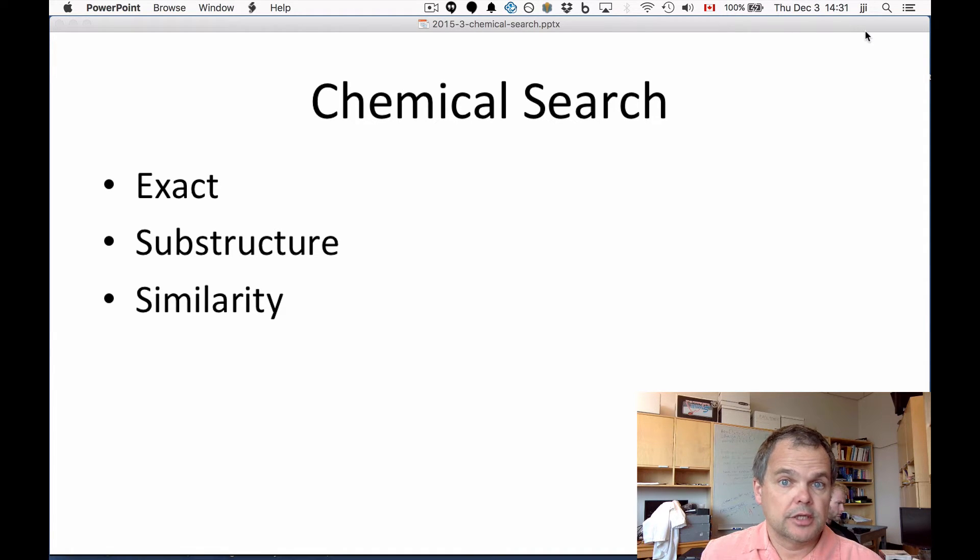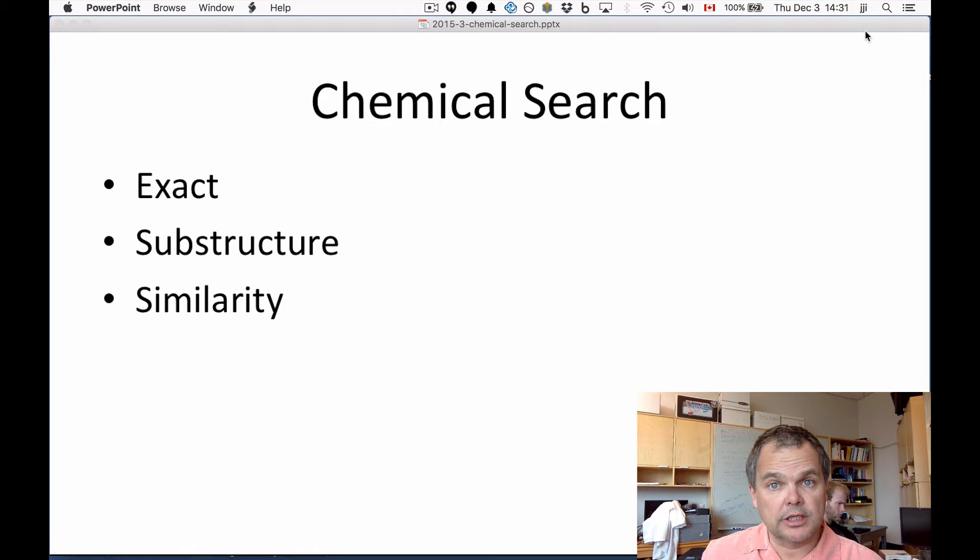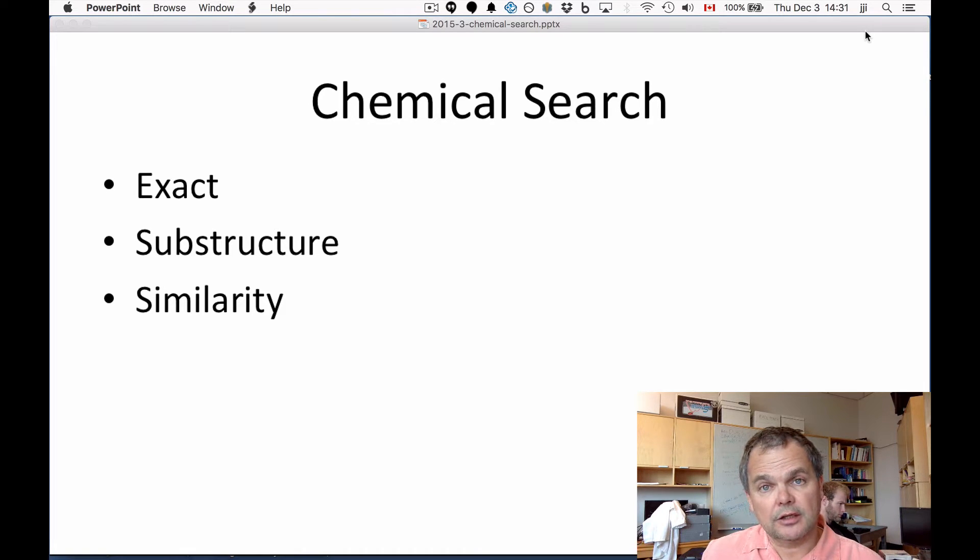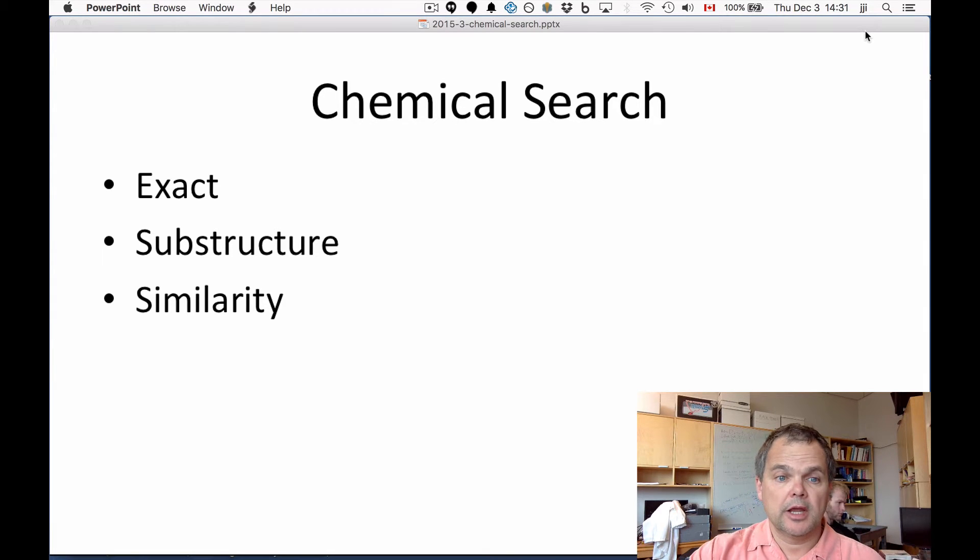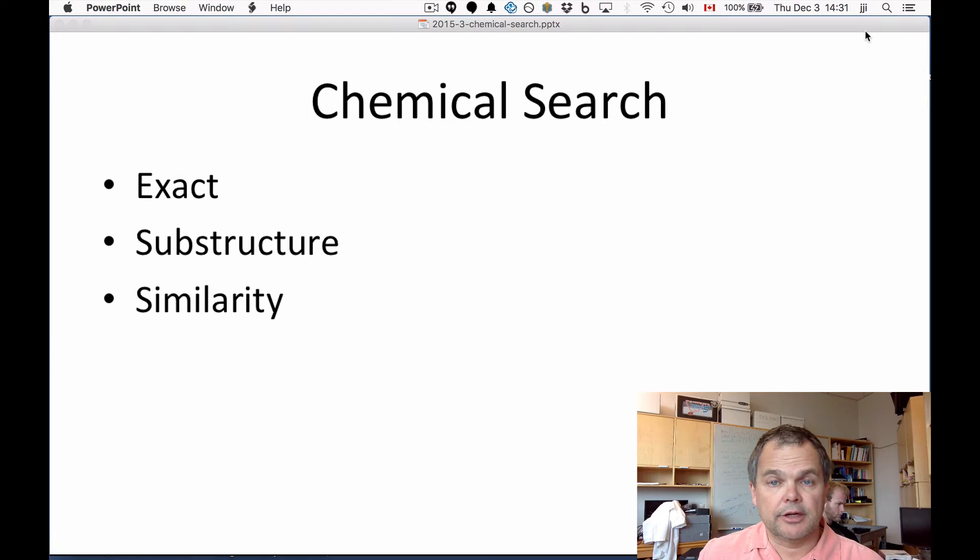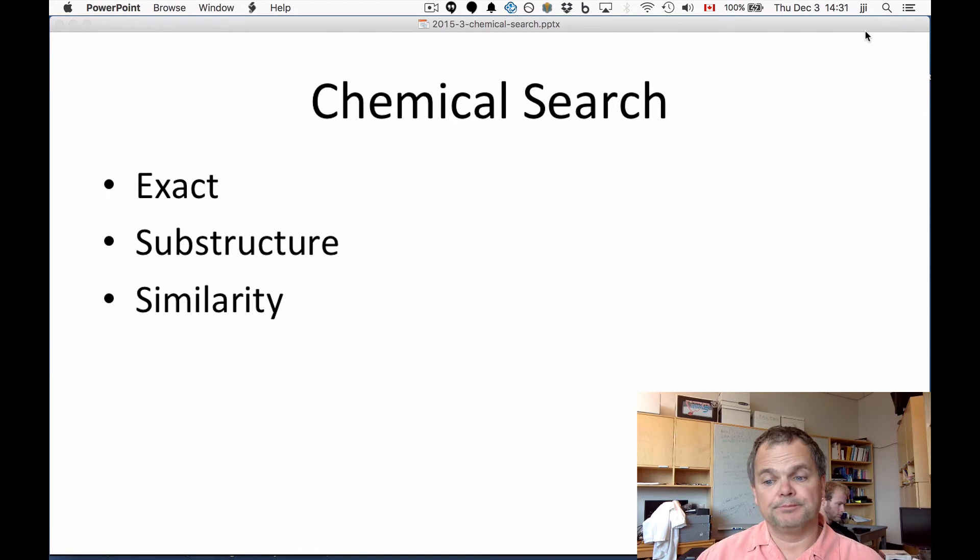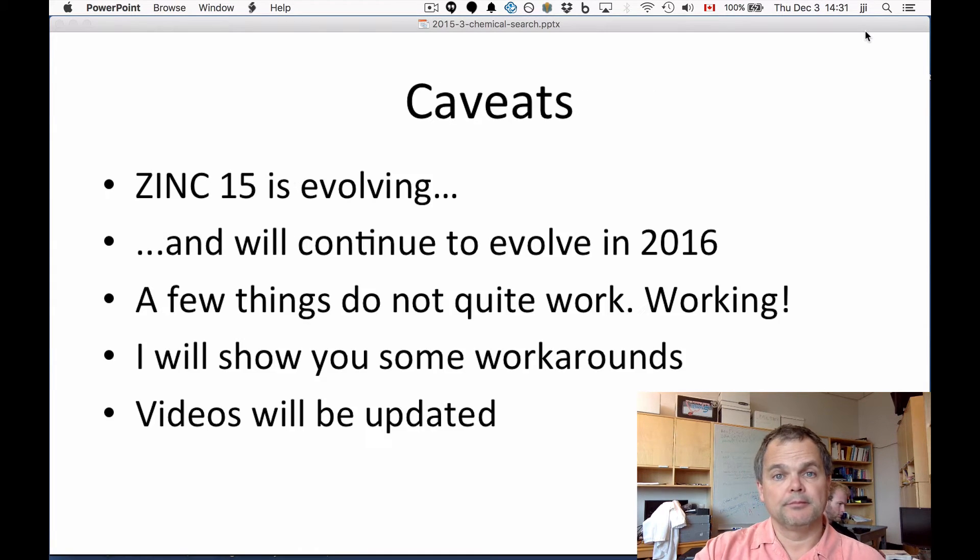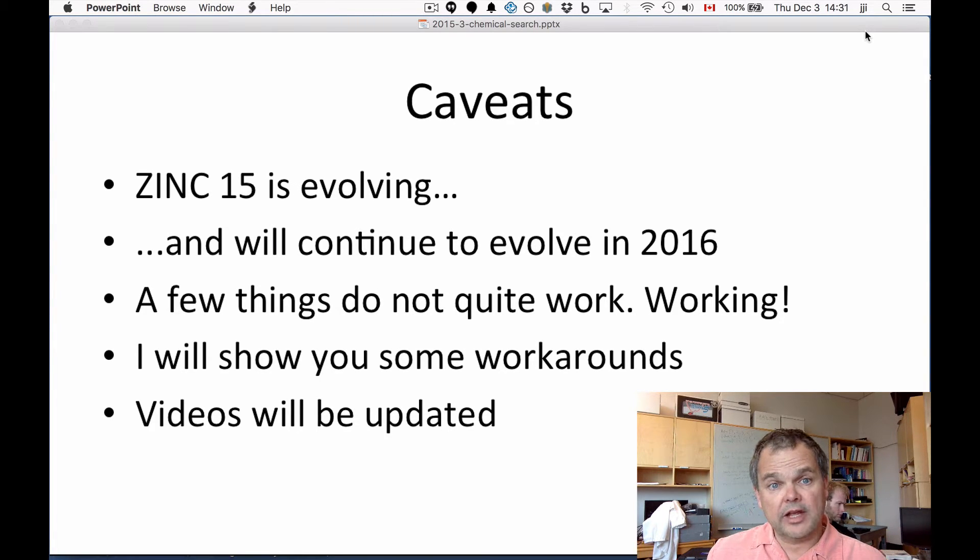Number two is substructure search, so find me all the molecules that contain this moiety. Substructure search can include both molecules as well as SMARTS patterns. And thirdly, similarity. So find me all the molecules that are similar to my molecule. Before we get too deep into this, I wanted to give you some caveats.